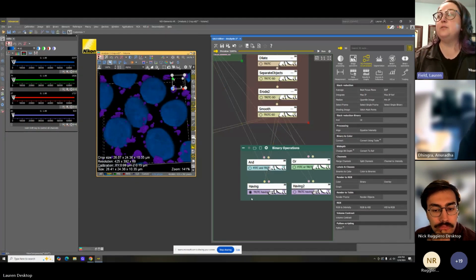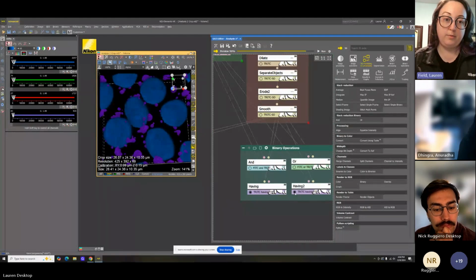This will be contrasted with the other way that we have this, where the first part of this binary is being directly pointed at the pink binary. So any structure in pink that contains yellow would be this render of purple.